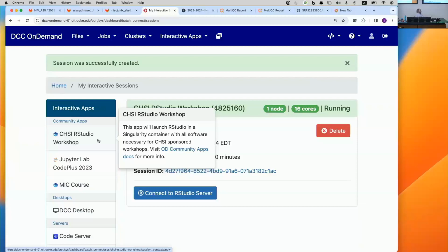Yeah, so I actually had a question about that, because I've taken our lab from no RNA-seq to a whole pipeline by setting up miniconda and environments and all that kind of stuff. That's why I was asking about the RMD, because I was like, holy crap. I was thinking about how you set up your different environments. So it sounds like you run a single container that has all of your versions and Python versions and all that kind of stuff, and then run everything out of there.